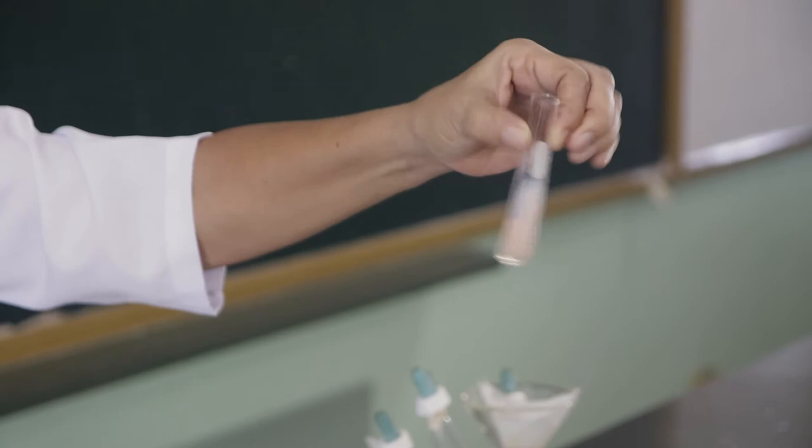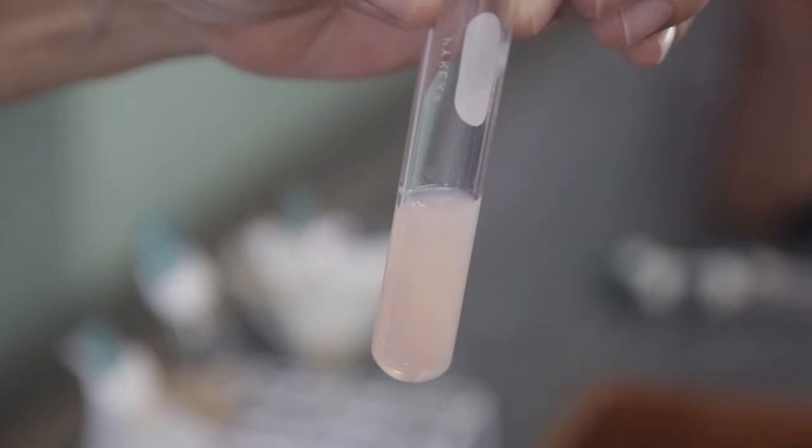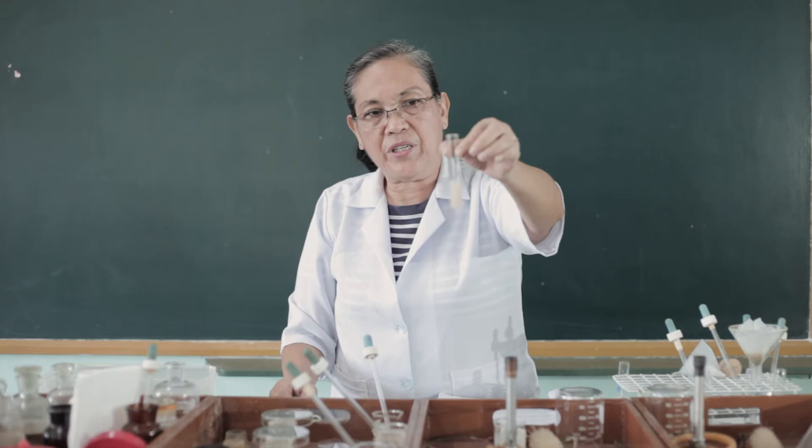Take note what happens. And because there is a precipitate that is formed, this is an indication that the chloride ion is also present.